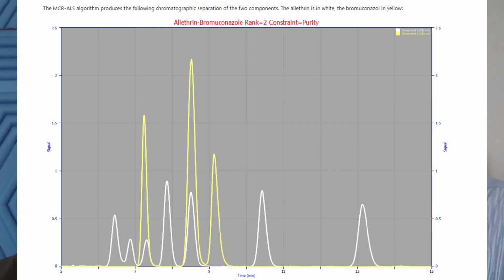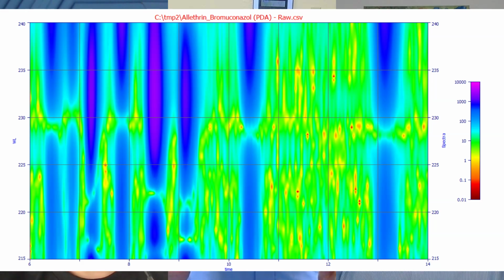And the other item I wanted to show was that with the 3D data, if you look at the first derivative, again, this is the method Farooq helped me to see, you see these little zones between each of these elements in this same separation. Each place where you see the little 0 point in the first derivative, if I were to look at just that particular spectra, that particular component will be gone. So by basically doing chromatography of the first derivative instead of the raw data, at each of these places where you see zeros, you can go in and erase that individual component from the data.